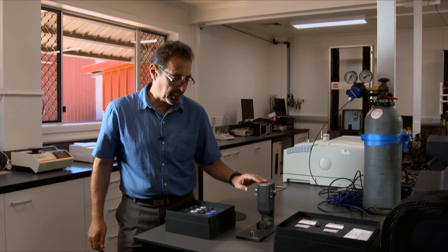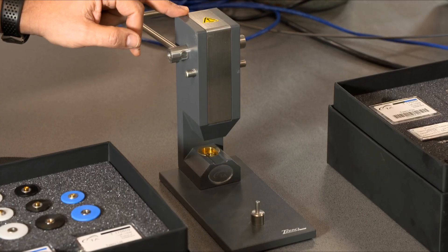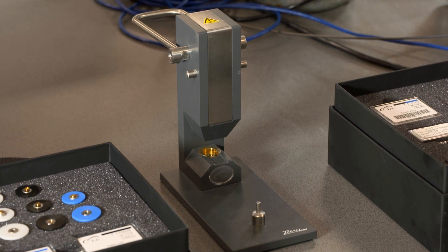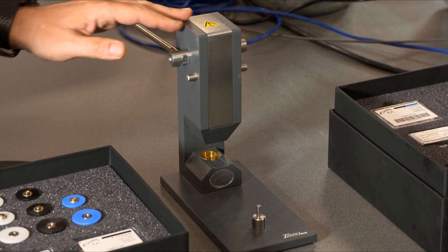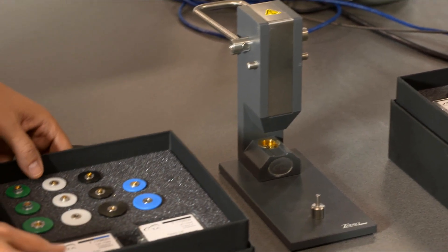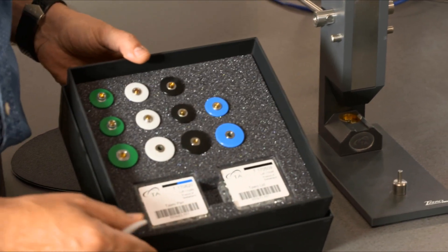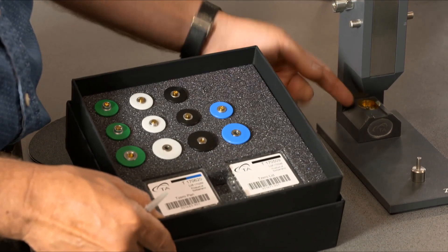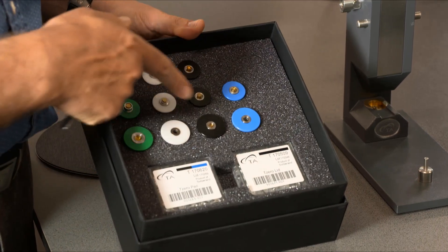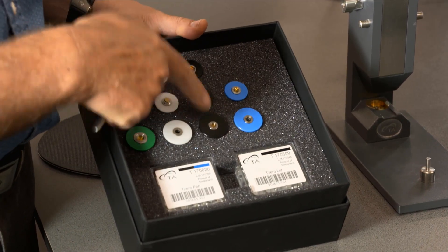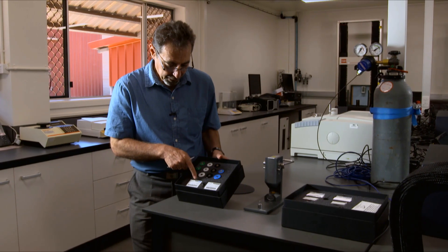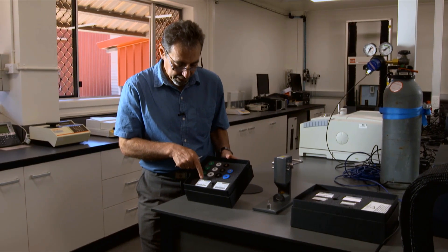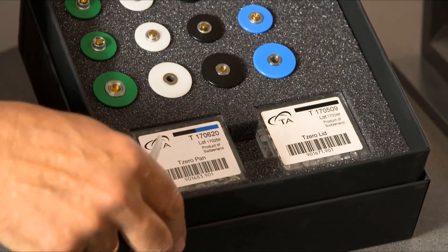Tzero Press is used to crimp the samples for a DSC instrument. It comes with a set of dies for the lower part and for the top part. As you can see, dies are color-coded and your boxes with pans and lids will be color-coded too.